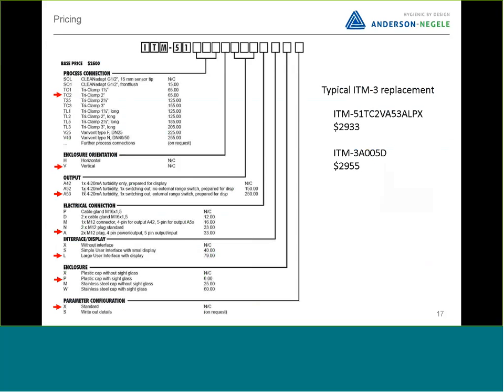So if you don't know what they're doing with it, but you need to get it on order, you need to order an A53 to cover all the bases. However, if the customer knows all they need is a 4 to 20 milliamp output with turbidity, you can readily select an A42. Just keep in mind that they will have to wire their cable differently if they're retrofitting.